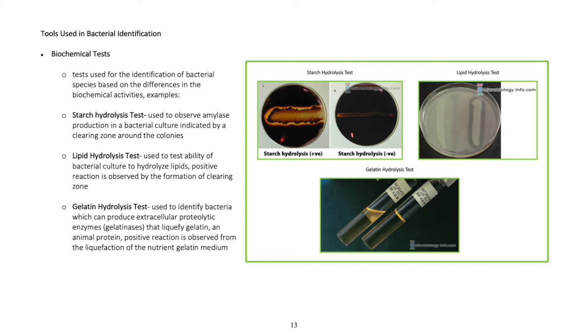A positive reaction is observed by the formation of a clearing zone. Gelatin hydrolysis test is used to identify bacteria which can produce extracellular proteolytic enzymes, or gelatinases, that liquefy gelatin, an animal protein. A positive reaction is observed from the liquefaction of the nutrient gelatin medium.